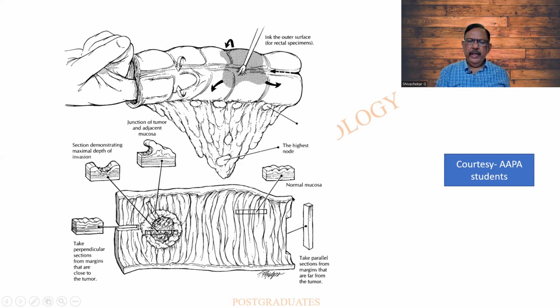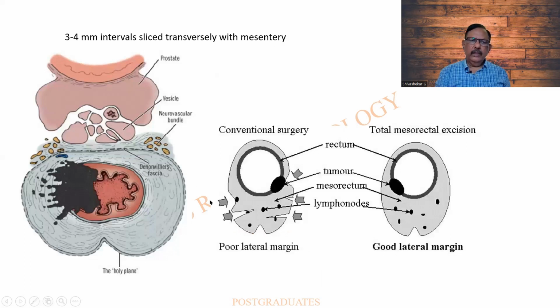In this, what they have done is correct. They have taken it perpendicularly so that the normal histology is displayed. But here what happens is there will be an inner longitudinal and an outer circular because of the interchange that is done. This is the importance of the cut surface. Usually I used to think about the longitudinal surface, but see what happens.